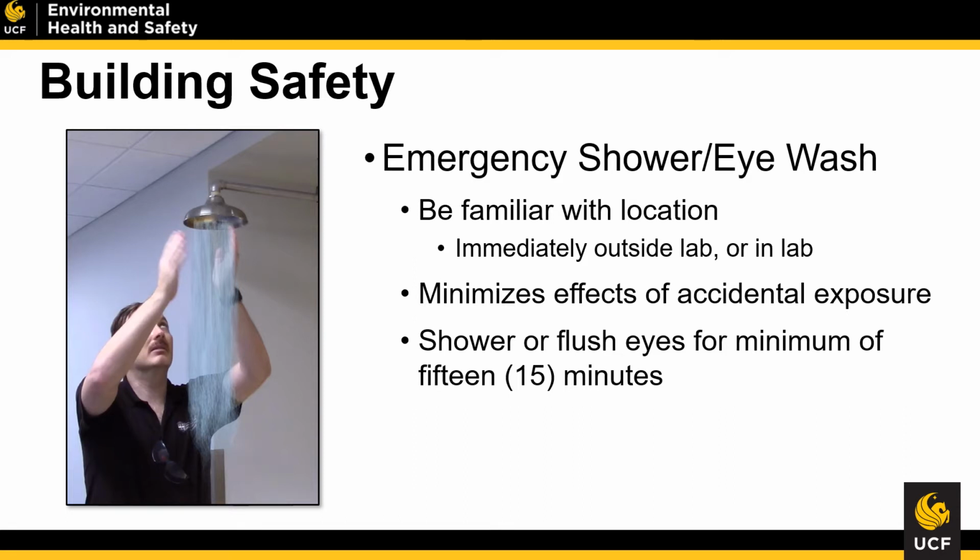And the same thing is true with the emergency eye wash. It's about 5 gallons per minute. In the event that you have to use the emergency eye wash, you're most likely going to have someone hold your eyes open for those 15 minutes because your eyes will start to swell and close. But we need to make sure that you are submerged for at least 15 minutes so that way we can reduce your exposure to whatever that hazardous chemical is. Be aware that not all buildings have floor drains. Some of our older buildings lack that, and water will be spread across the entire floor.